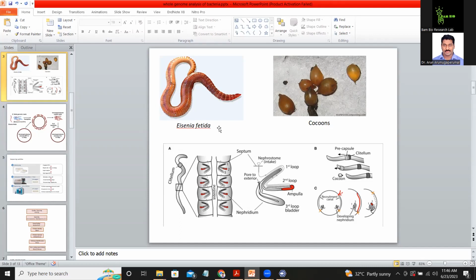So we can predict that by looking at the gene. There are many antibiotics, and there are antibiotic resistance genes and antibiotic sensitivity genes. We can look for any antibiotic sensitivity genes present in the genome of the bacteria, and then we can predict that if this antibiotic is present, this population is vulnerable. So we can avoid that. Or if a resistance is there, we can predict that this is resistance to this antibiotic. So we can do these kinds of efforts.